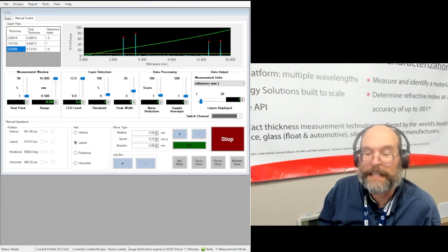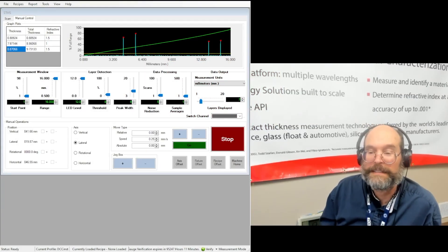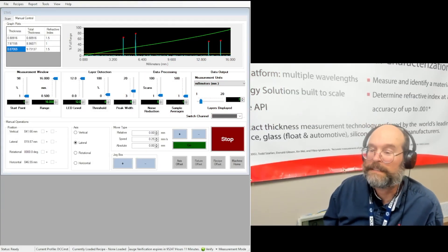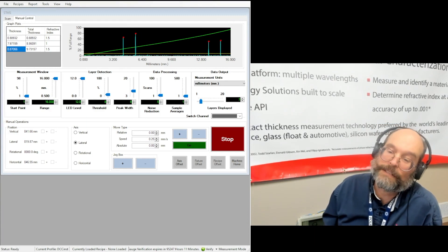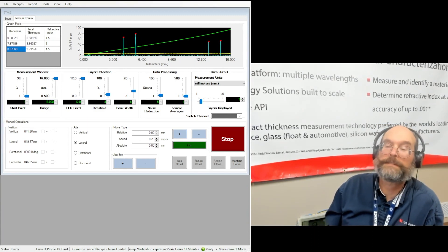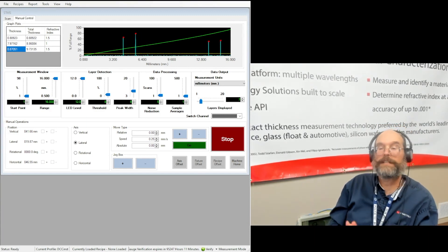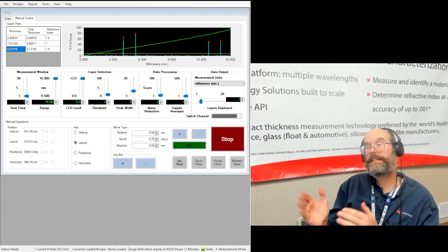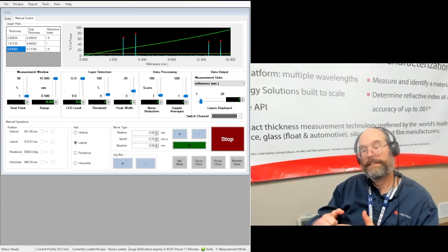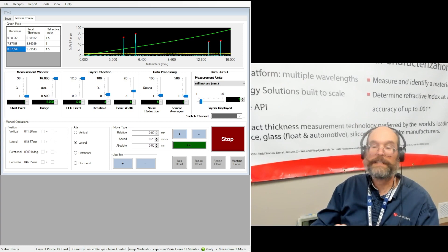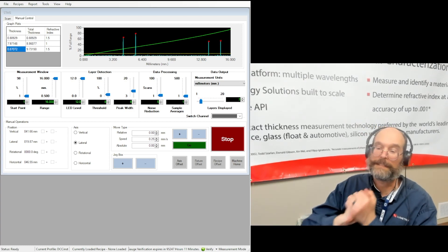Hello, this is Dave Kampretor, Technology Development Scientist at Lumetrix. I'm going to go over LumetriScan software, particularly the fixture profile and the recipe creation.